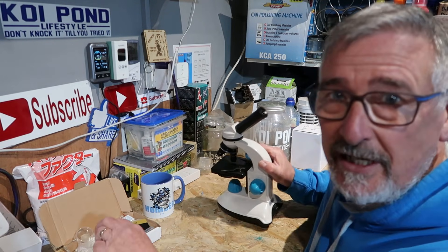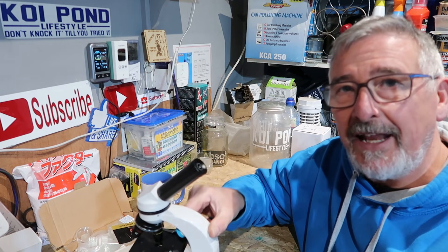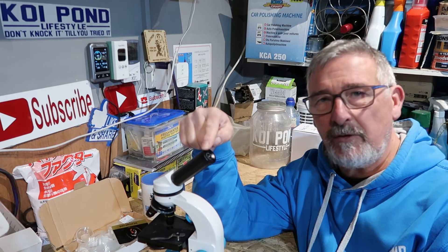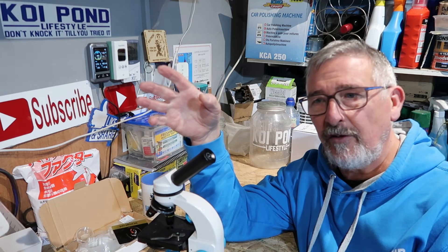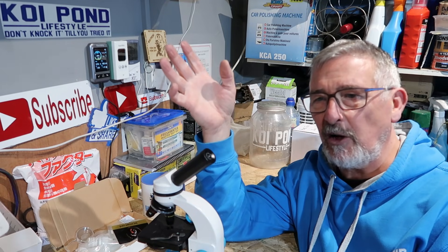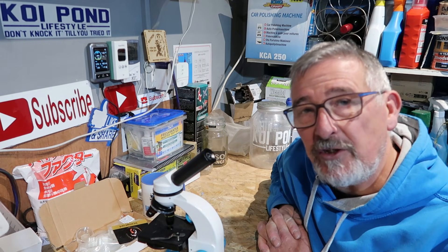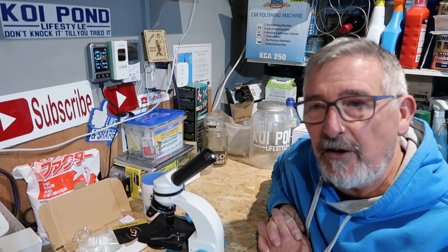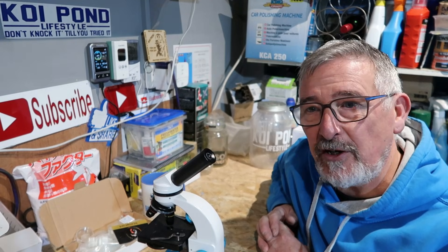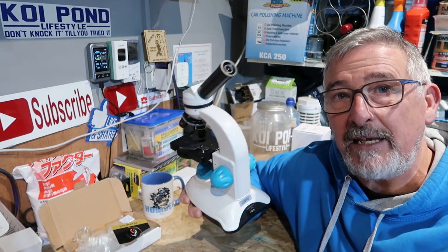Microscopes — life savers, these are. Once you've got a microscope you can be so much more self-sufficient in how you're looking after your fish, spotting problems, and dealing with them quicker. If you've got any parasites in your pond it really helps. You can get a scrape off your fish, have a look at it, and move quicker rather than having to contact your local dealer — because by the time you get there, most of the stuff on your scrape will probably be dead anyway. Parasites don't last that long in fresh air, so these things make you so much more efficient and able to keep your fish alive for longer.